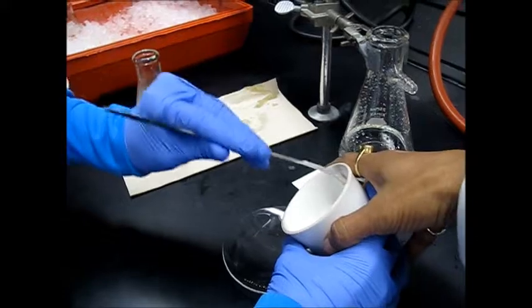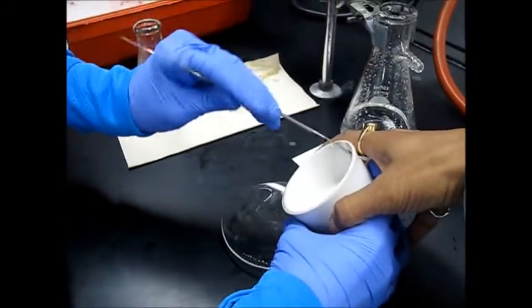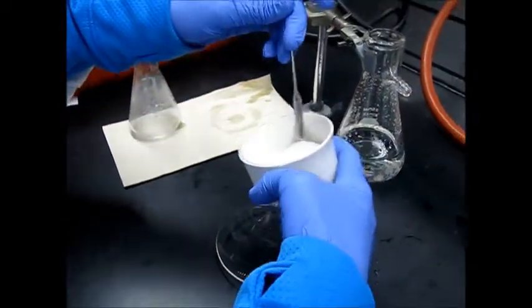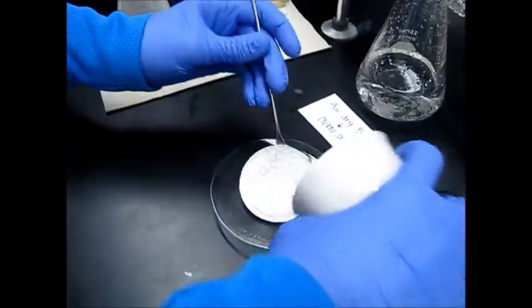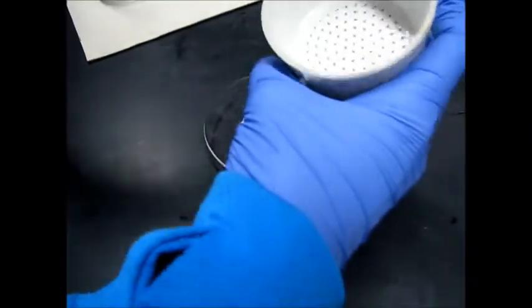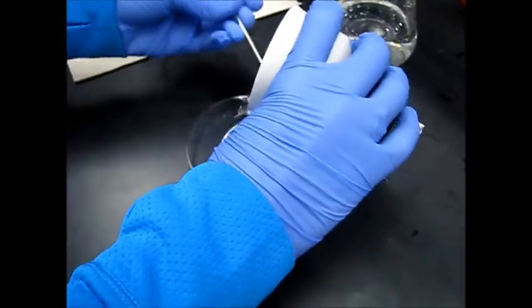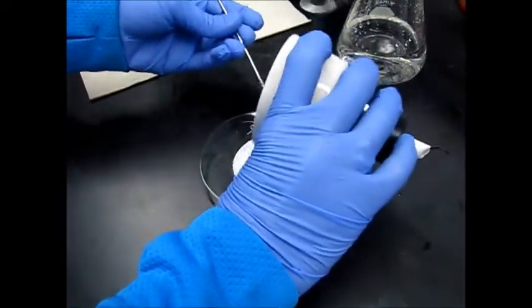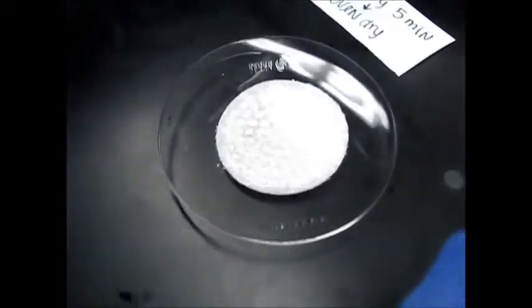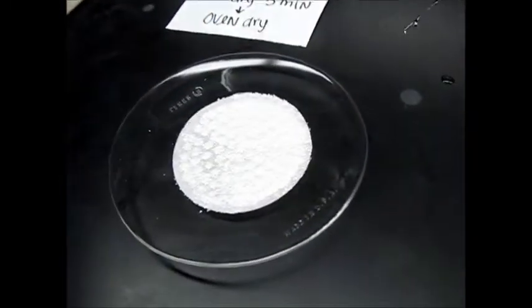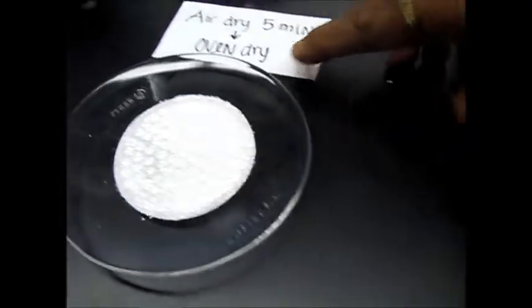Now we will use the spatula to scrape the sides of the funnel. We can remove this and then with the filter paper, everything. Very cool. And then we have to clean this Buchner funnel for second time use. So this is for benzoic acid.